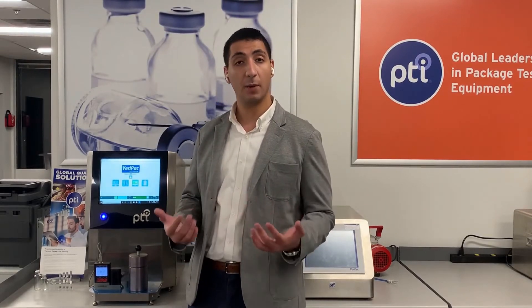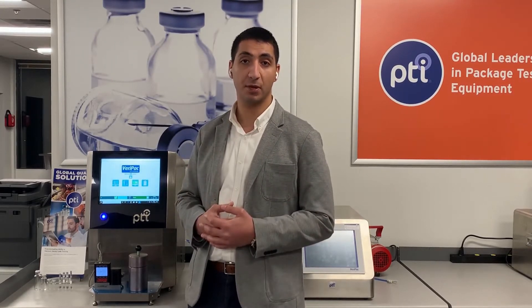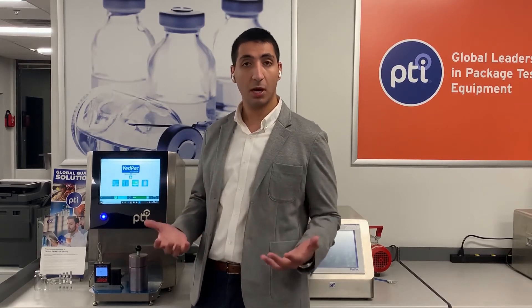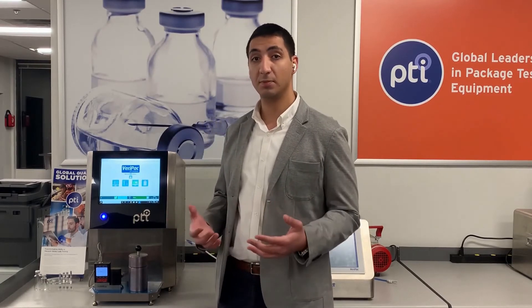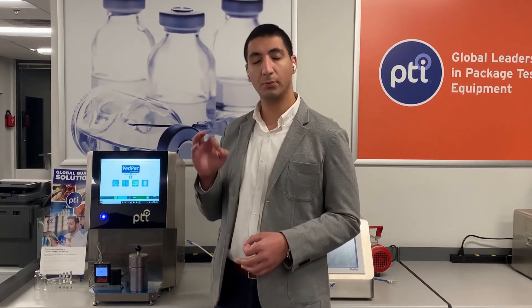M8 mode allows a more stable point in time to reference for the system, and also provides the capabilities to inspect for those extremely small micro leaks. Of those three cycles, cycle 1 consists of a mode that allows the system to detect for large leaks. Cycle 2 is meant for smaller micro leaks, and cycle 3 is meant for those extremely small molecular leaks.